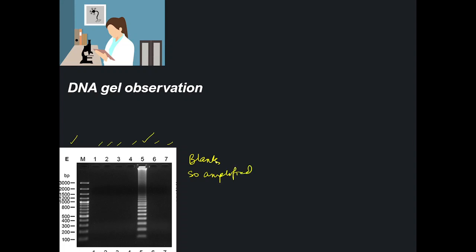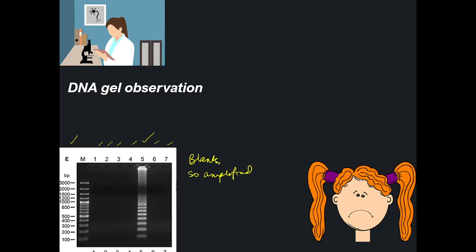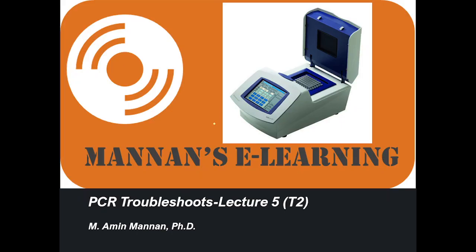Ruhi was very disappointed and she had no clue why this happened. If you are a researcher in an early career and you are working in a molecular biology lab, I welcome all of you to Mannan's e-learning program. In this series of lectures, which is a technical lecture, I am going to talk about PCR troubleshooting. If you do not know me, my name is Mannan. I am a PhD in molecular biology.